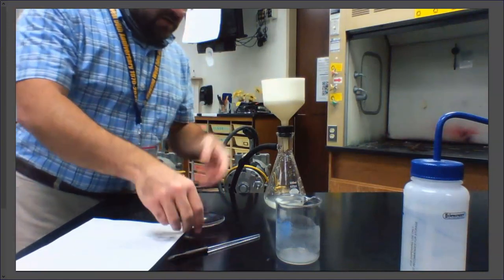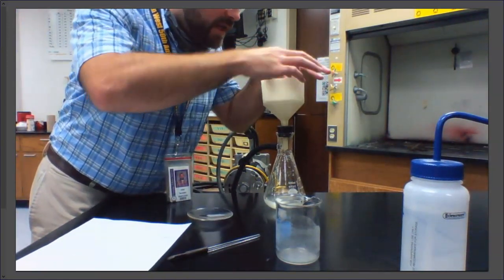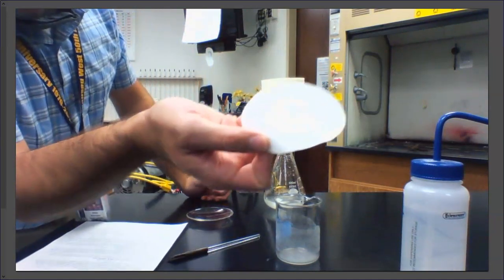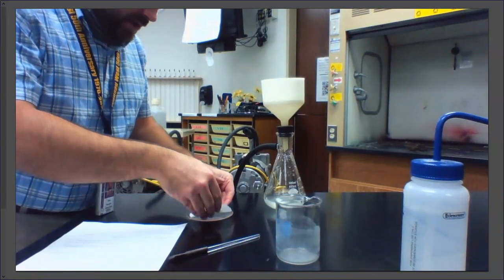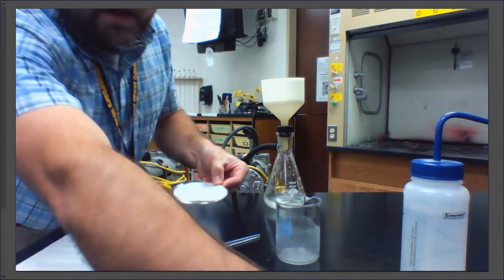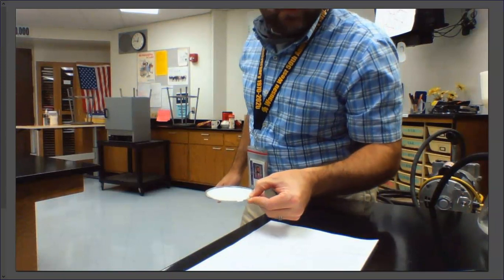But I'm going to take my filter paper out without spilling any of my sample. Okay, and I'll kind of show it to you, if maybe you can see it. I don't know if it's kind of washed out. But there's white powder stuck on there now. And I'm going to place that on a watch glass like such. And now I'm going to go place this in the oven. So I'll turn my camera here. And way back there, underneath the clock on that cart, that big gray box, that's just a drying oven.